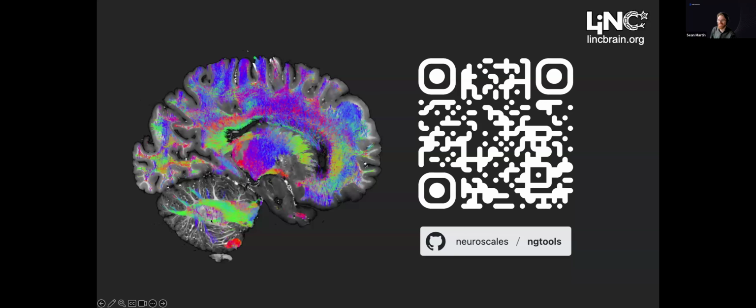That's great. Thank you so much. I'm really curious about what drew you to Neuroglancer. I know you mentioned part of it is that it can deal with larger data. Part of it, I've seen, maybe the integration with Python, but from your perspective, what drew your team to Neuroglancer?